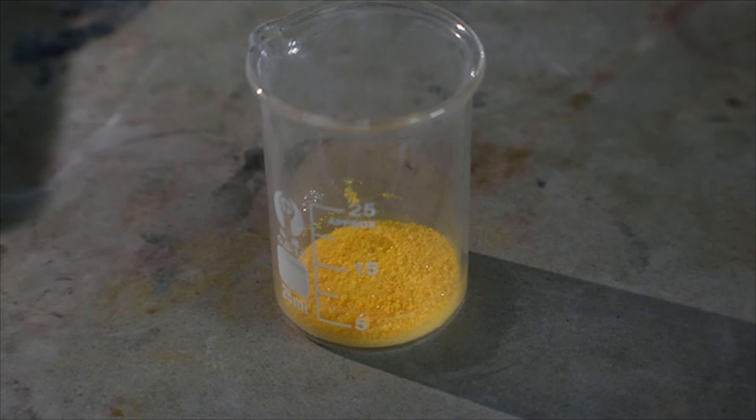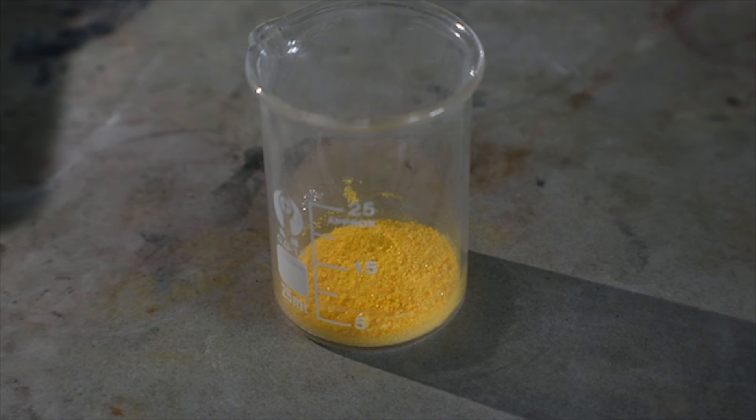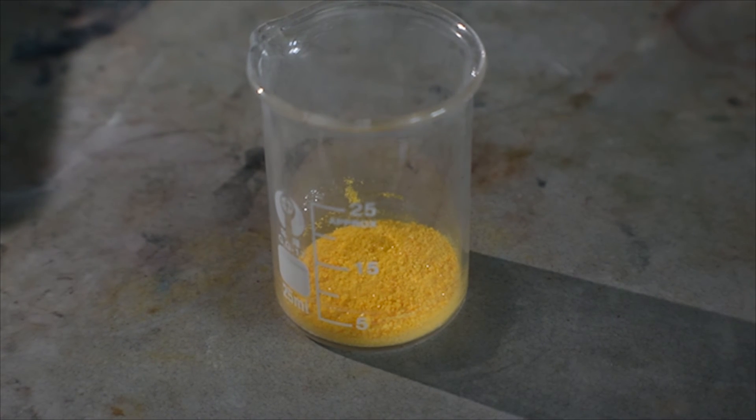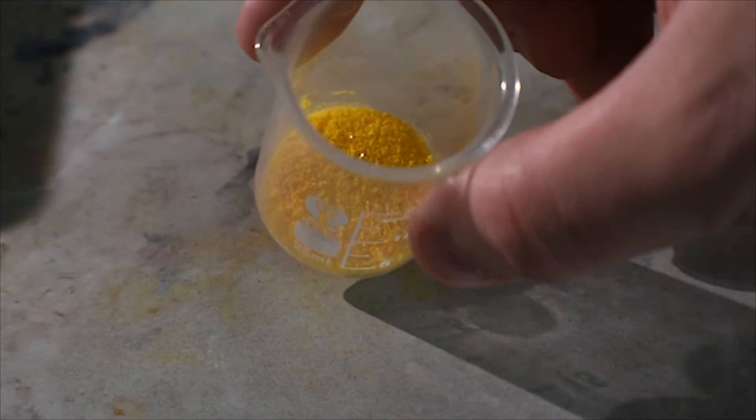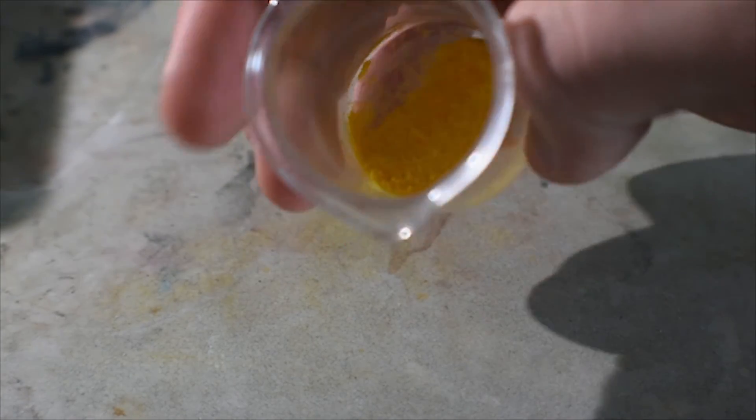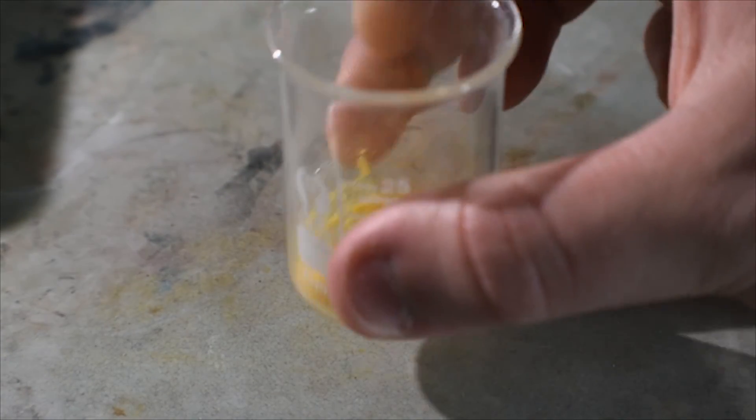So here's the solid cesium tetrachloroiodate after drying. A nice golden-yellow solid with a crystalline texture to it that is free-flowing and does not absorb moisture from the atmosphere. It is stable in storage and does not release any iodine trichloride.